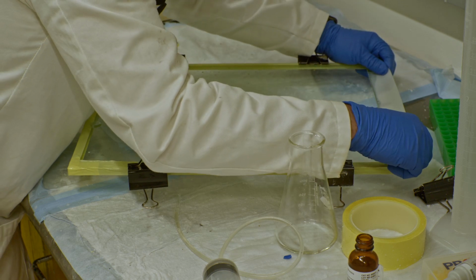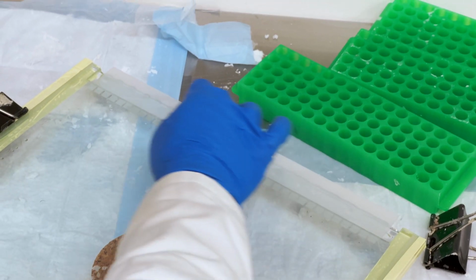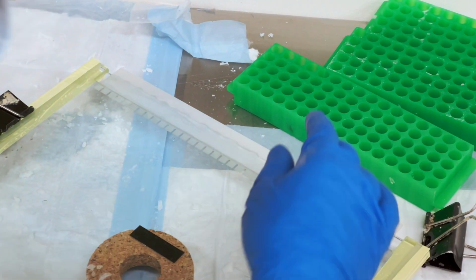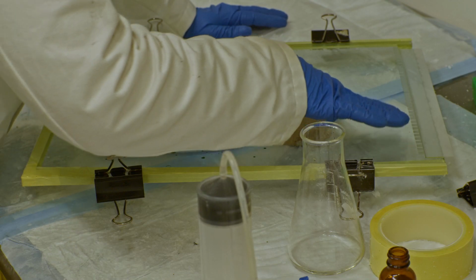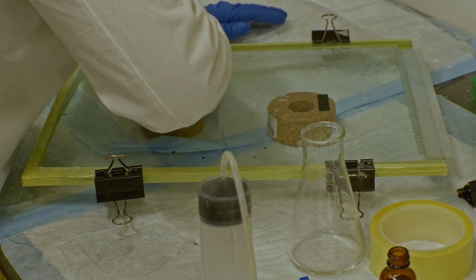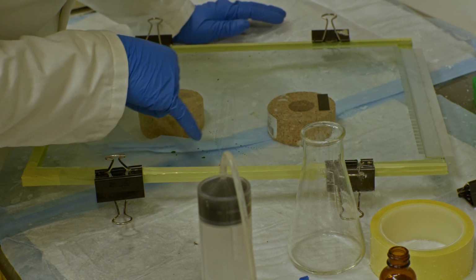then quickly lay the gel down and insert the comb. And it's done. So the next thing you want to do after you put in that comb is visually inspect that there are no bubbles anywhere in the area where you want to do your experiment.